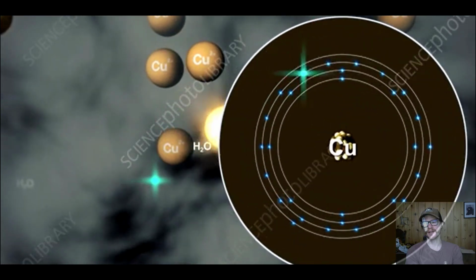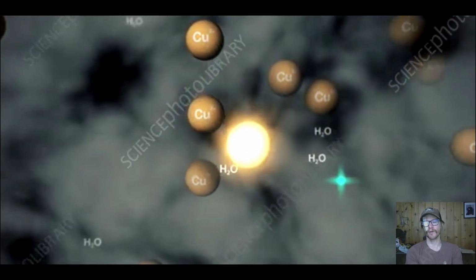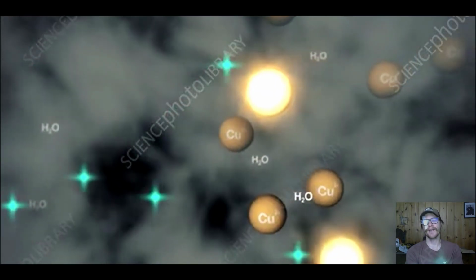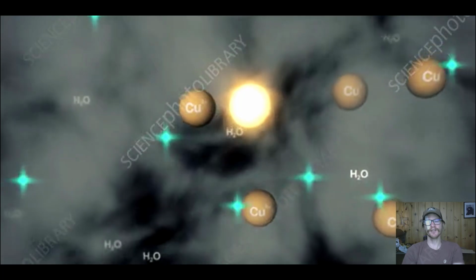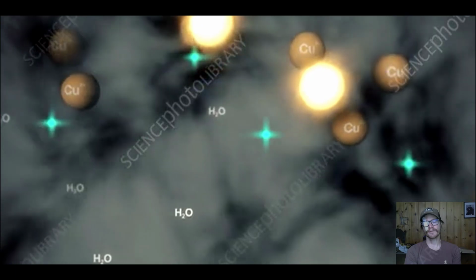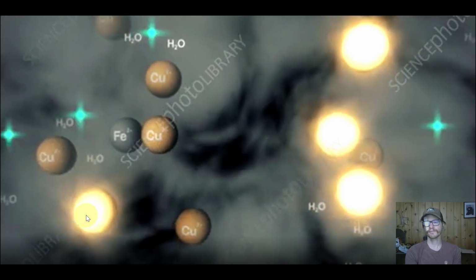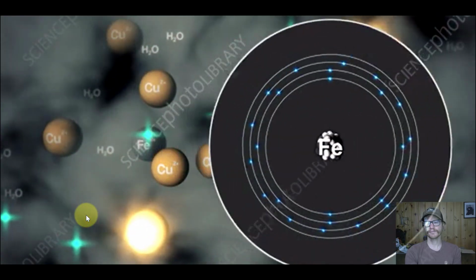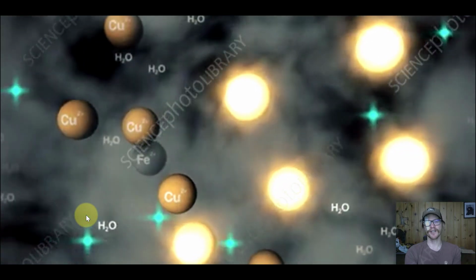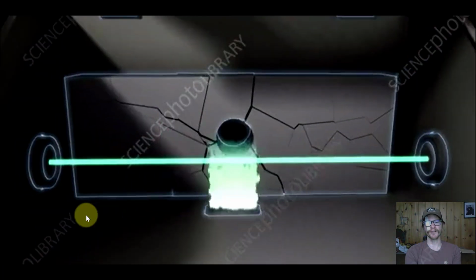And as one of those photons strikes a copper atom, it gets excited to, again, a higher electronic state in its atomic orbitals. And then it absorbs that light. Right? And so that's one photon that doesn't make it to the detector. And that's really the general principle for how an atomic absorption spectrometer works. There's an iron atom, not enough or exact energy for it to excite that atom because energy is quantized and those atomic orbital energy levels are distinct.